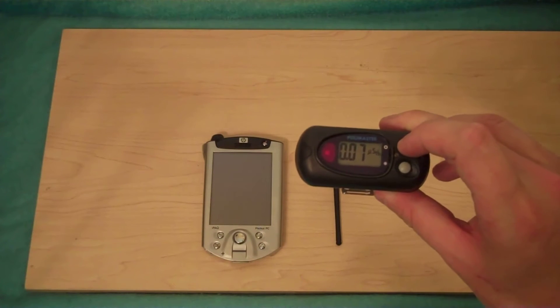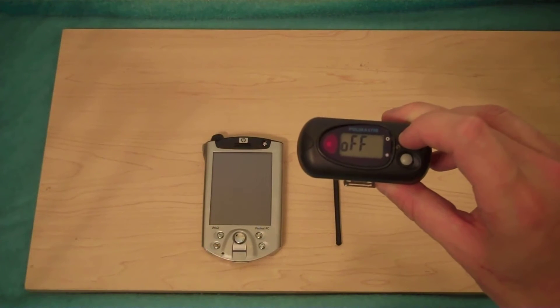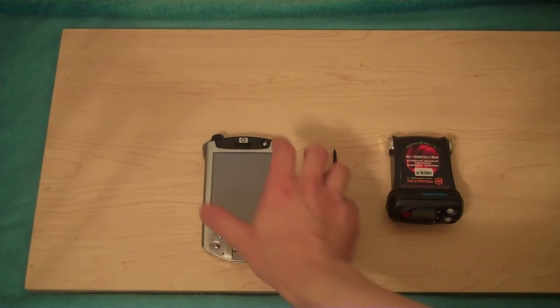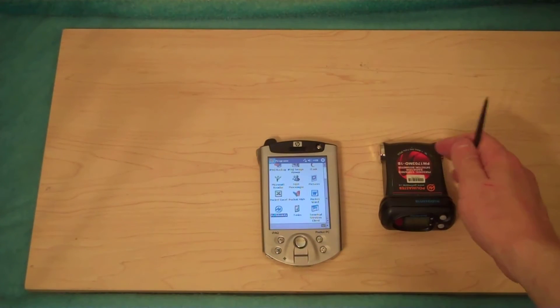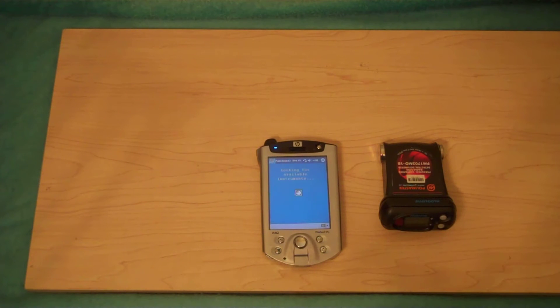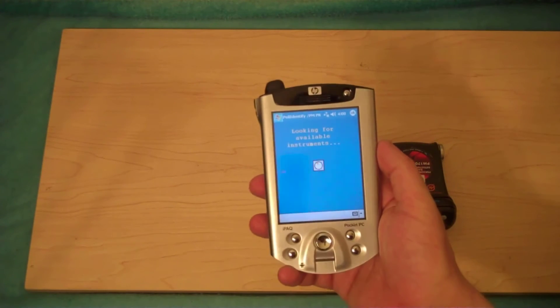We're going to hit the mode button until we see the word 'off', then hit the light button to turn the unit on to Bluetooth mode. Now we can connect to computers, PDAs, whatever supports Bluetooth. Let's turn on the PDA and start the PolyMaster PolyIdentify software. The software is now looking for units and will hunt down whatever unit it can find, which should be this unit close to you.